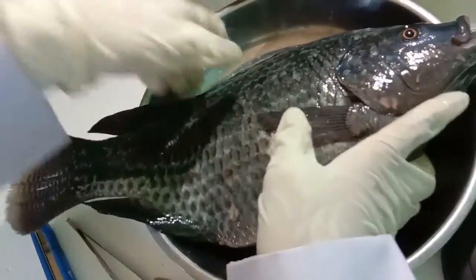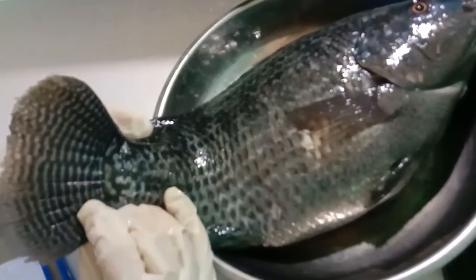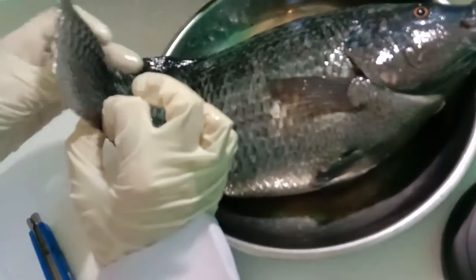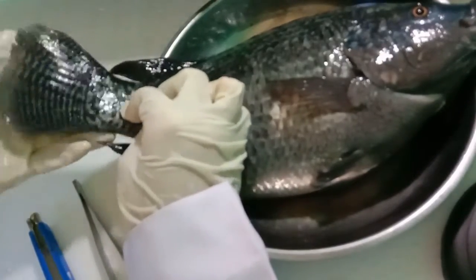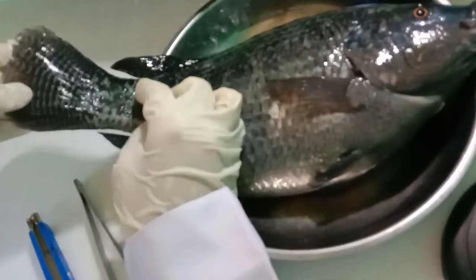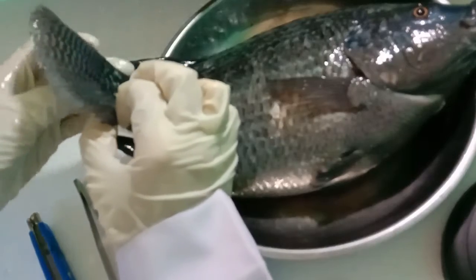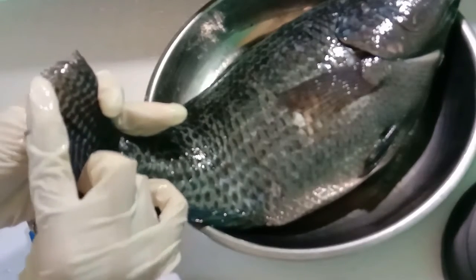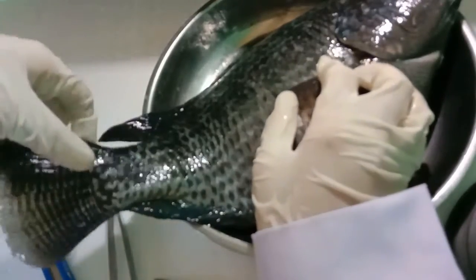And last but not least is the tail. There is the caudal fin here. The base of the caudal fin is called the caudal peduncle, which is equipped with strong swimming muscle, which functions as a propulsion like a motor on a ship. The caudal fin on the tilapia fish is of the truncate type, the upright H. Here you can see the H of the tail. It's truncate type. This type of fin serves to turn quickly.